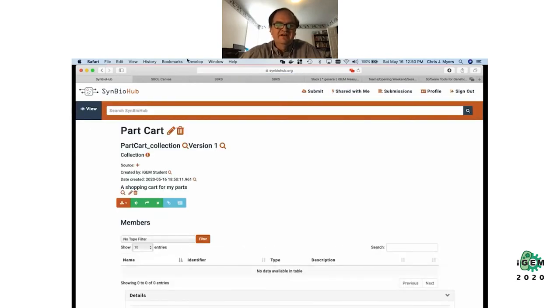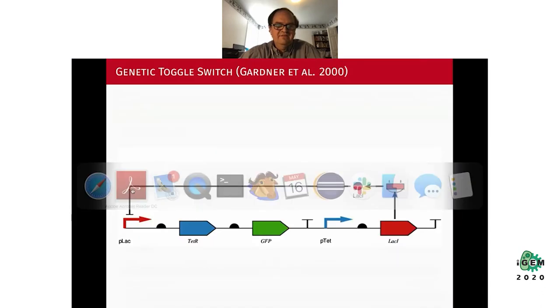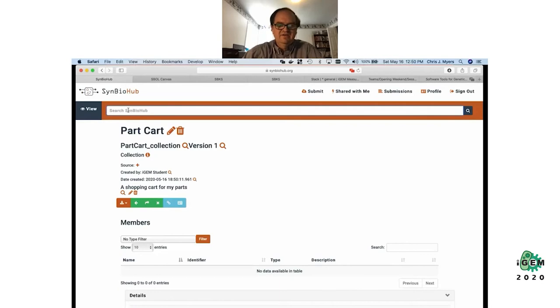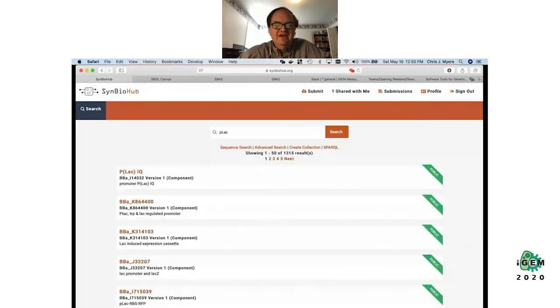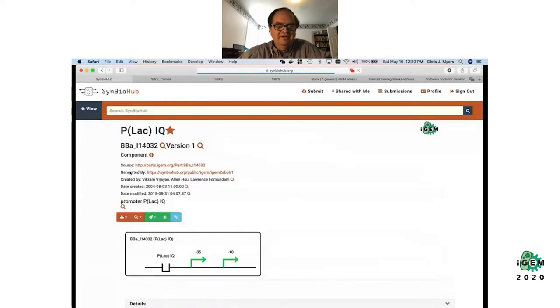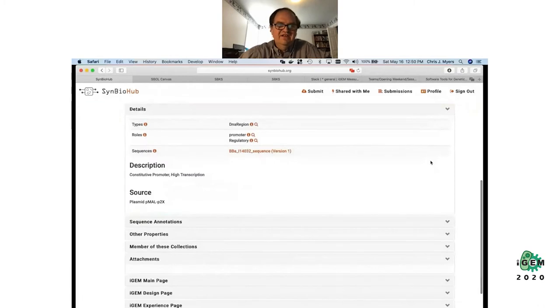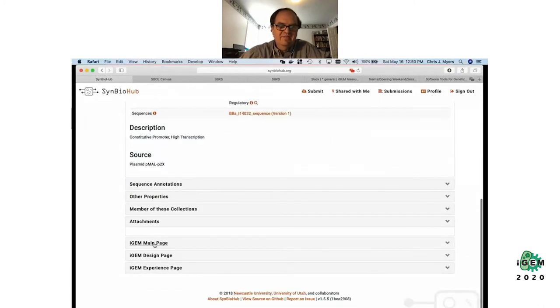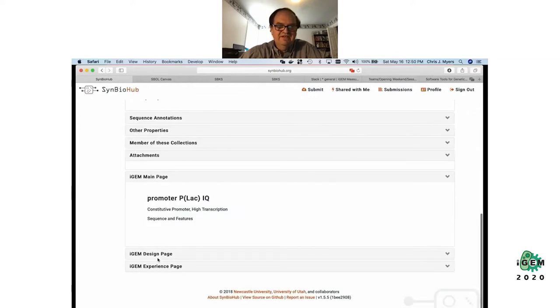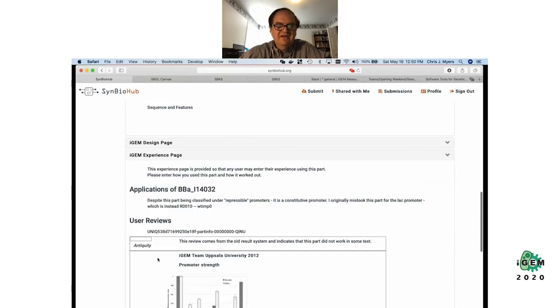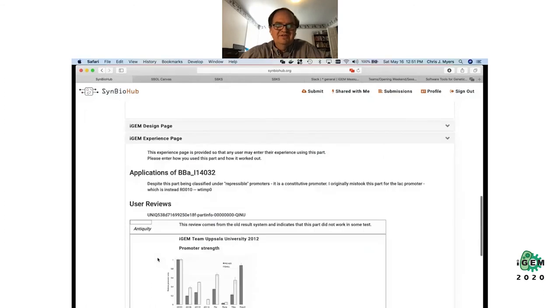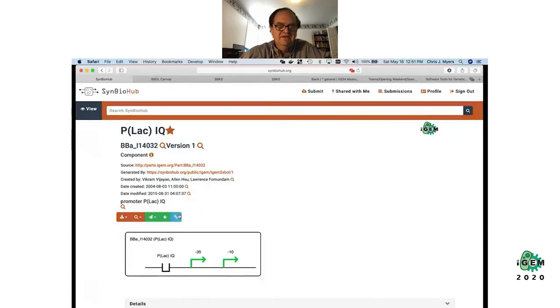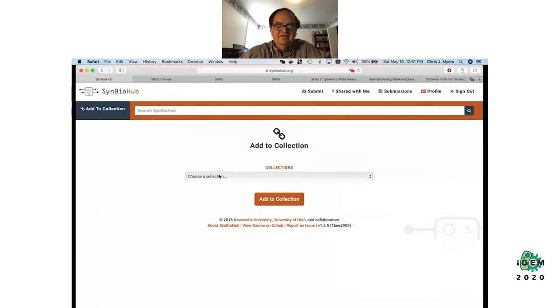Now I want to put some parts into here. I need the pLac promoter, so let's look for that. This is using the iGEM dataset that we translated into SBOL and deposited in SynBioHub. I found what looks like a pLac promoter and I can scroll down to get more information like the DNA sequence. I can also look at the iGEM information on the iGEM registry pages. That looks good, so I want to put that into my cart.